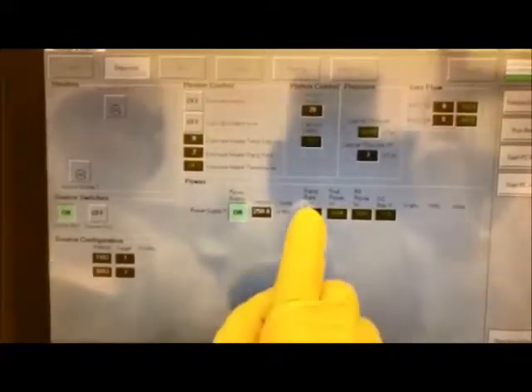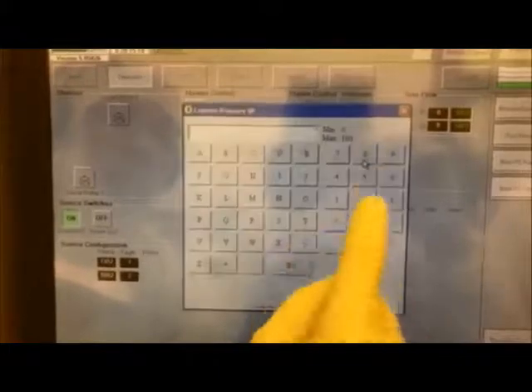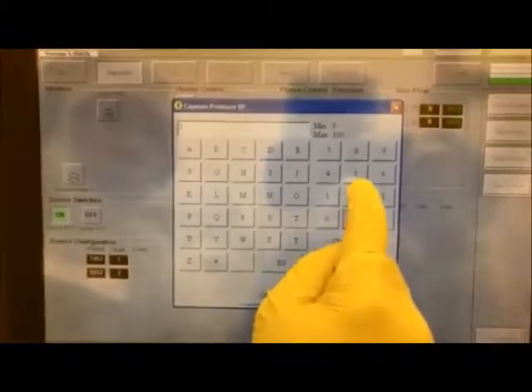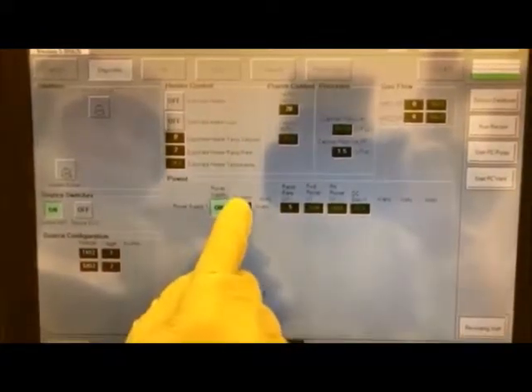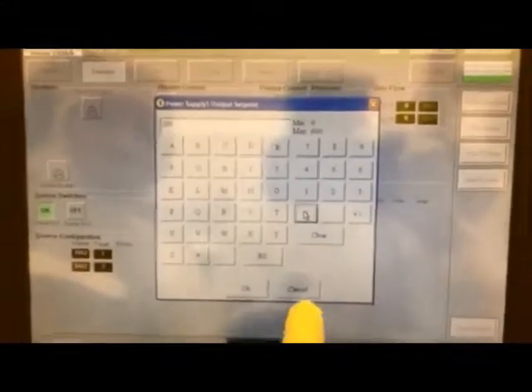So now we are ready to do the last step. Once again, we start with the ramp. So we set 5 watts per second, and then we change the pressure from 3 to 1.5. And finally, we bring our power to 300. And then we check our plasma. Yep, the plasma stays on, which is very good.